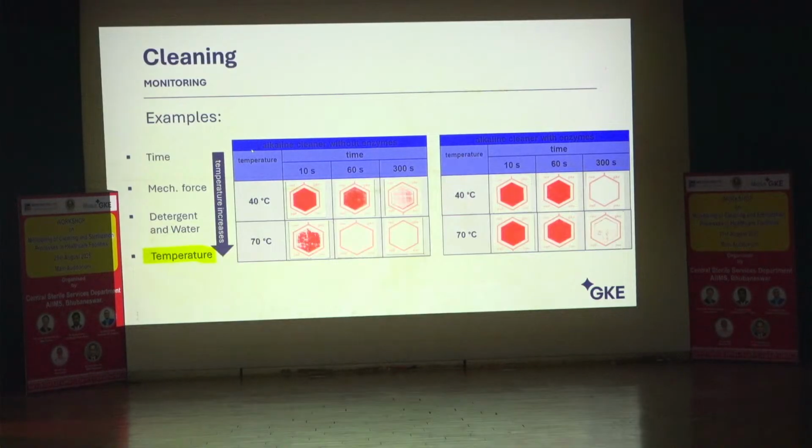And now we apply the 70 degrees and we see here the result is worse than that. Why? Because the 70 degrees centigrade has destroyed the enzymes and the enzymes could not work because they were broken. This is such an interesting result, which shows that one product works better with higher temperature, one product works better with lower temperature, and you can make it visible with this technology.